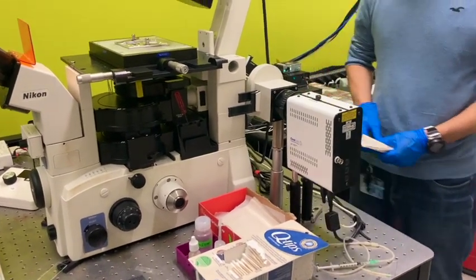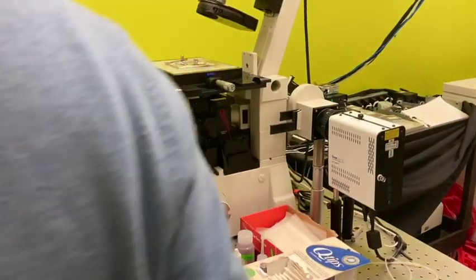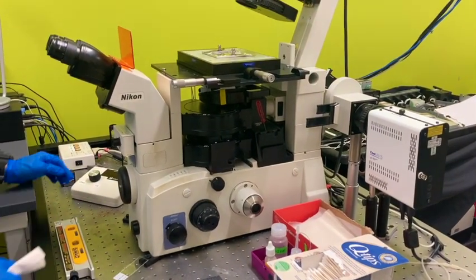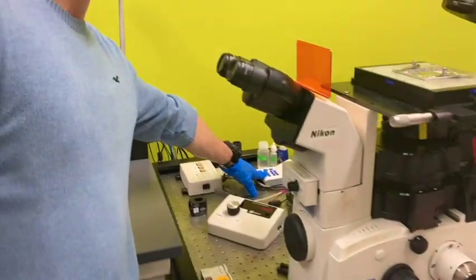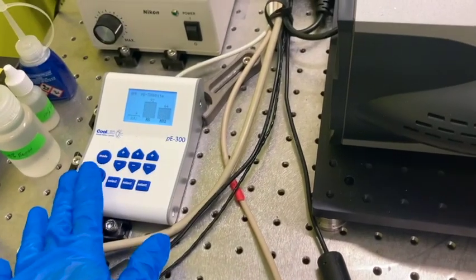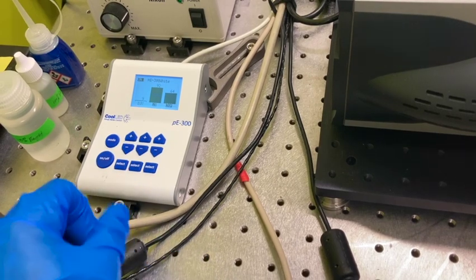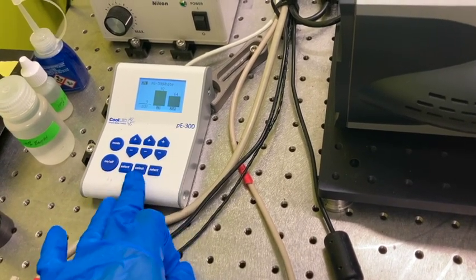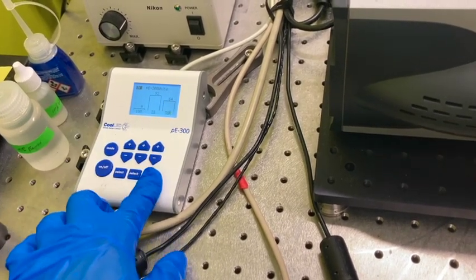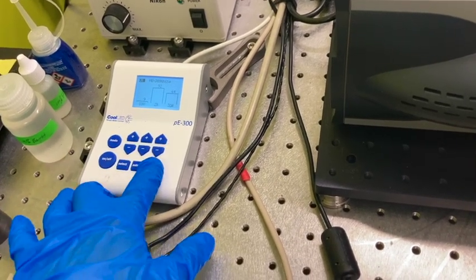And then this LED is used for IRM and goes through this epi fluorescence. And here is the power controller for that. If you come over a little bit, we have on, so we can turn the main power on, and then you can select 3 different channels individually. Unchecked, it's going to be blank, which means right now nothing is going out of that LED, and you can select either of them.